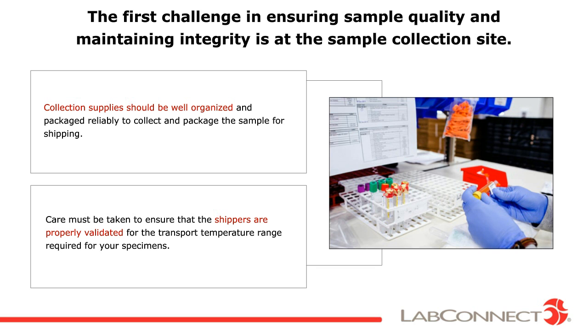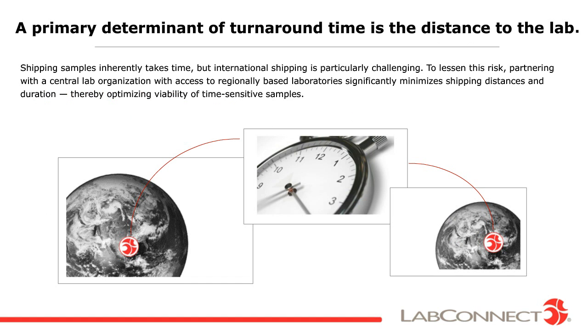Turnaround times are always a major focus when it comes to sample processing due to sample stability and viability. So for example, with PBMCs, we tend to target a 24-hour turnaround time. However, with these newer, more complex studies, we have gotten requests for up to 6 to 8 hour turnaround times, which makes it very challenging. And then when you add international shipping to the process, this will add a whole other layer of complexity.